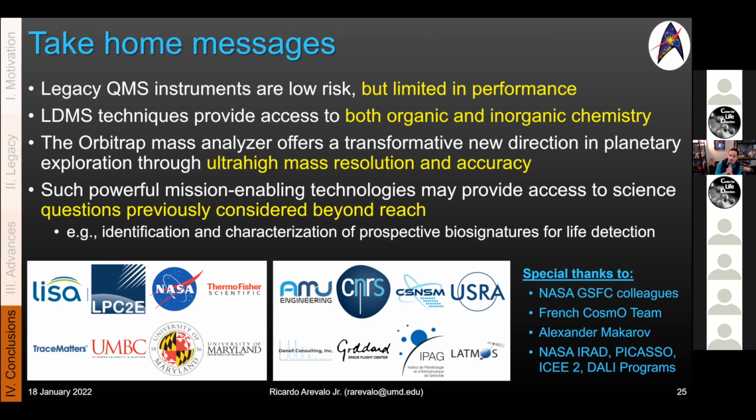Yeah, thanks. Great talk. I had a couple questions that I'll throw at you, and you can answer what you think is interesting. The most relevant question is, what's the upper range on the mass limit? I think everything I saw today, the highest number I saw was like 500 AMU. Obviously, you have an Orbitrap, you could go higher than that in principle. So my question would be, what's the upper range, do you think? And is that something you could set during the mission?